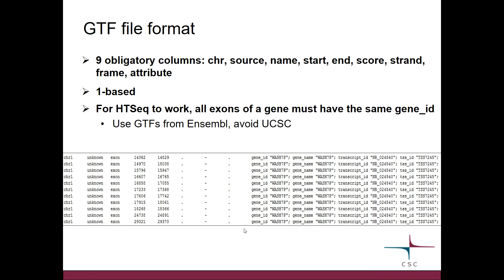HT-seq uses a BAM file and a GTF file. Chipster has many GTF files on the server, but you are also welcome to use your own. The GTF file has nine obligatory columns such as chromosome, start and end of the feature, and strand, with the last column containing lots of information like gene IDs and transcript IDs. If you use your own GTF file with HT-seq, you must ensure that all the exons of a gene are marked with the same gene ID. This is the case with GTF files from Ensembl, but not for UCSC GTF files.